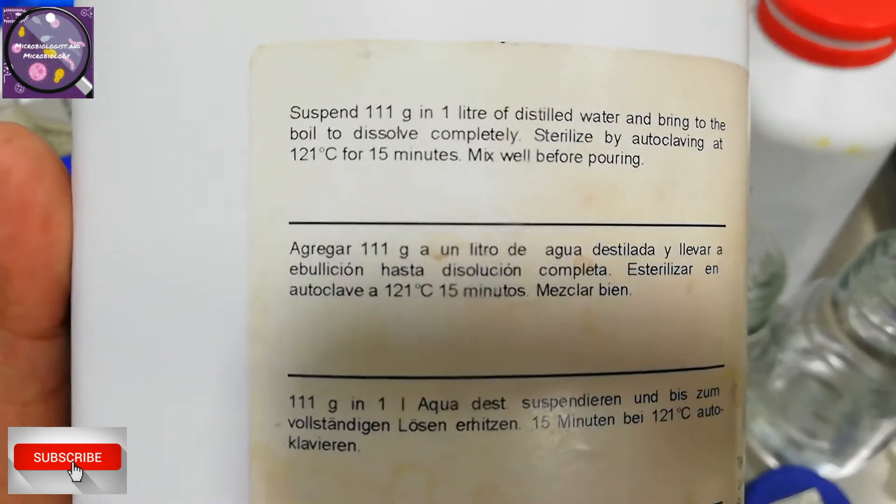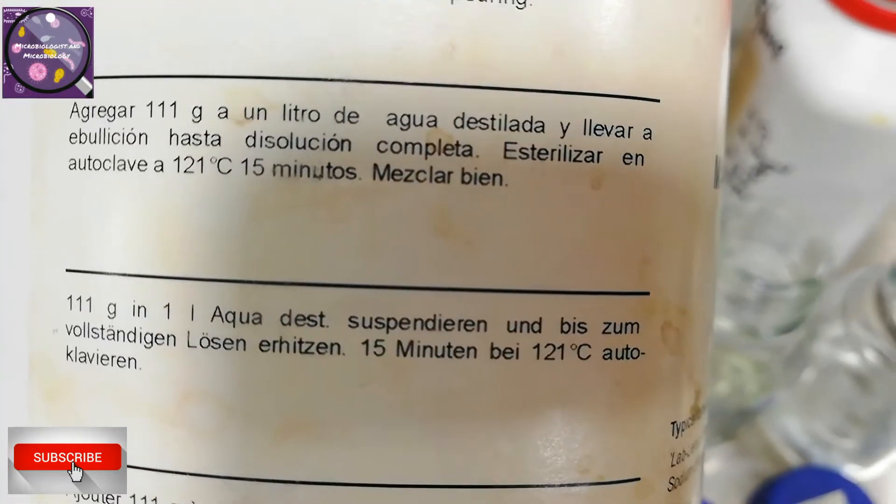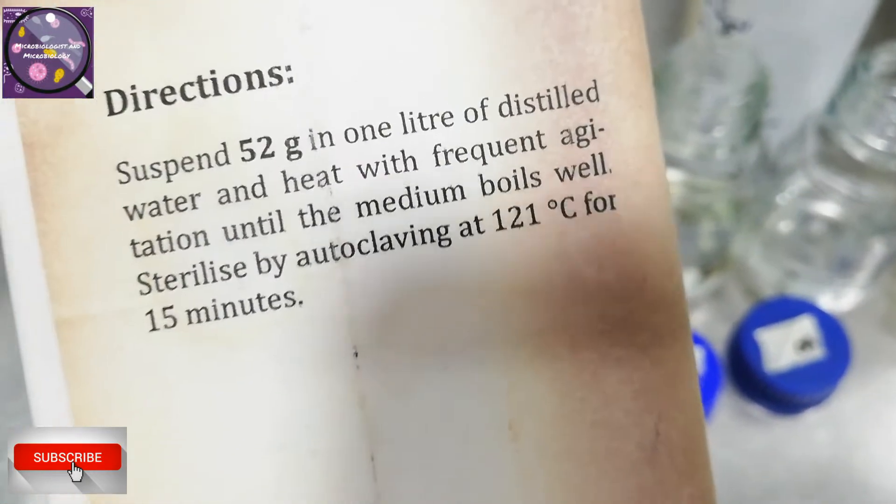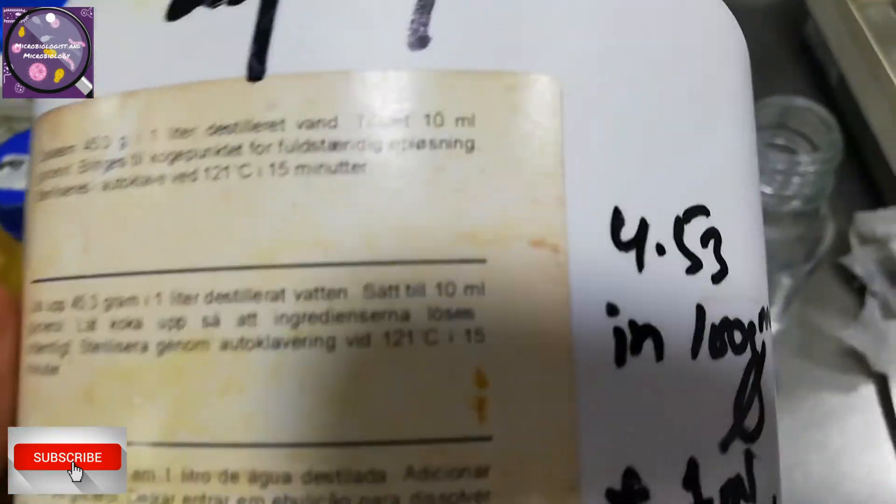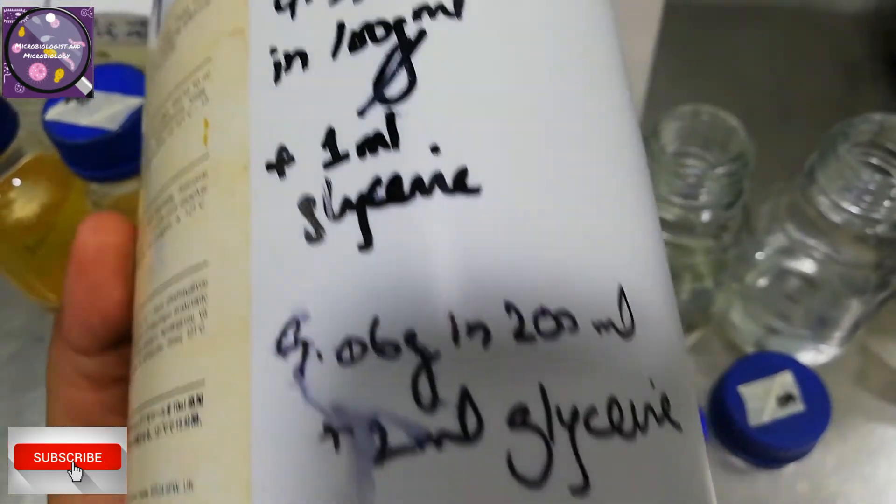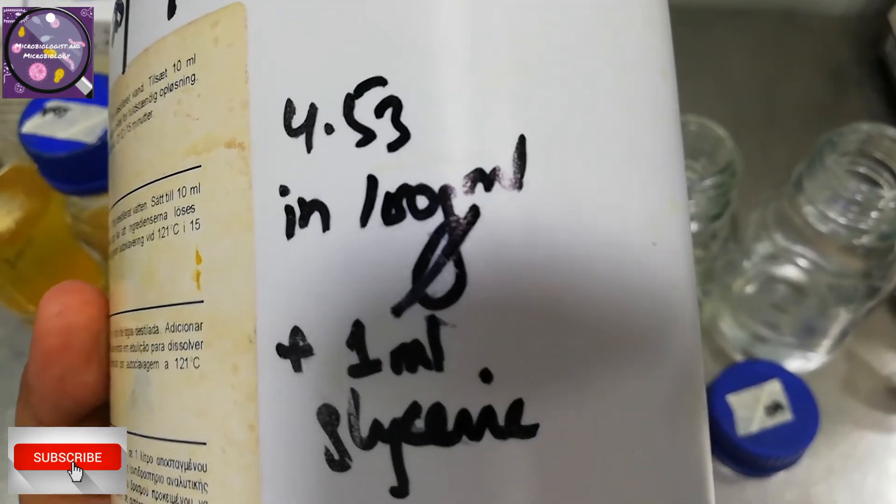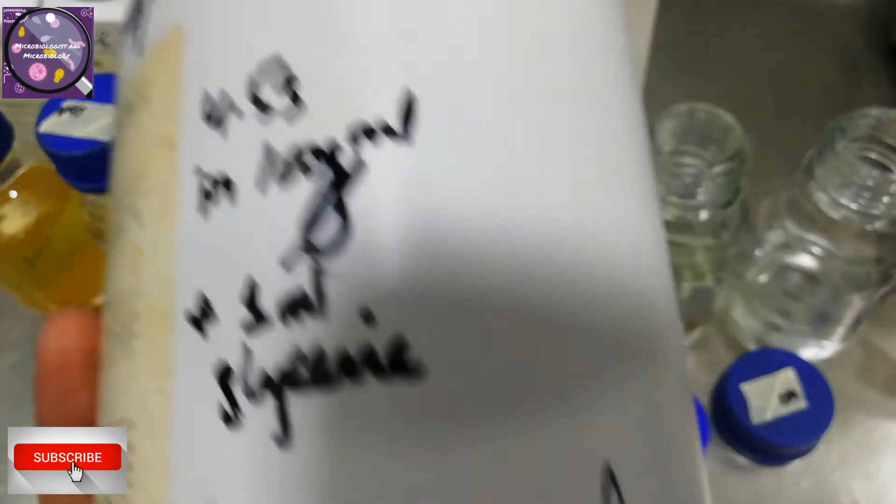For mannitol salt agar it's written as 111 grams required for 1 liter so I will use 11.1 grams for 100ml. This one is the dehydrated media for McConkey agar and it says 52 grams for 1 liter. I mentioned already to do easy work, like for 100ml we need 5.2 grams. For cetrimide agar that is the selective media for Pseudomonas aeruginosa, it is written as 45.3 grams in 1 liter plus 10ml glycerol. I calculated as 4.53 grams in 100ml plus 1ml glycerol. I also mentioned for 200ml to make my life easy. It is very useful when you write the calculated grams per ml on media bottles so you will not have to use calculator on daily basis.